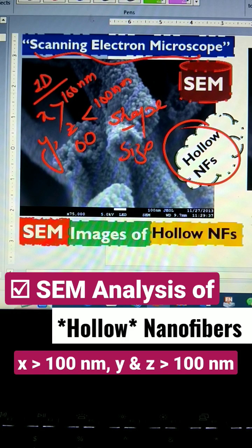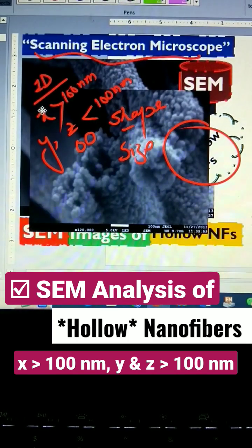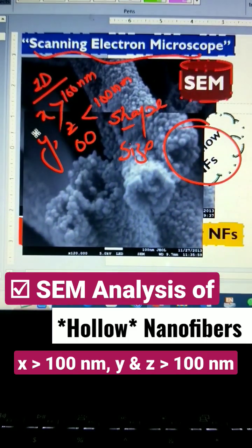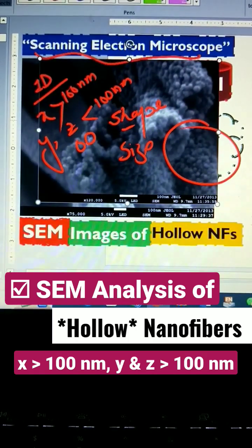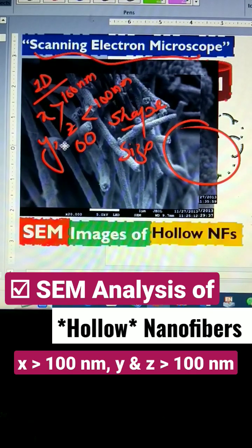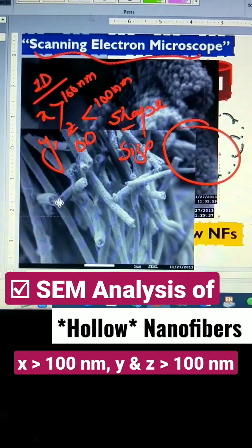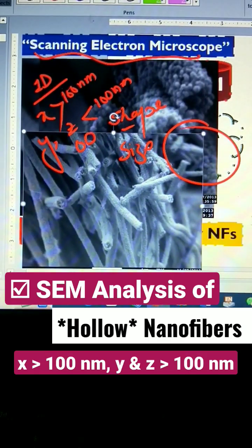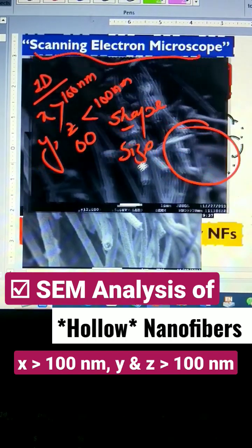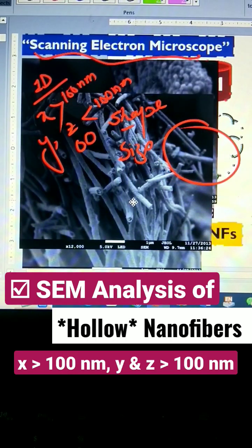Let me show some other images — very close-up images. You can see the pores are very clear here. And let me show you some low magnification images. Here you can see very interestingly — it is very visible.